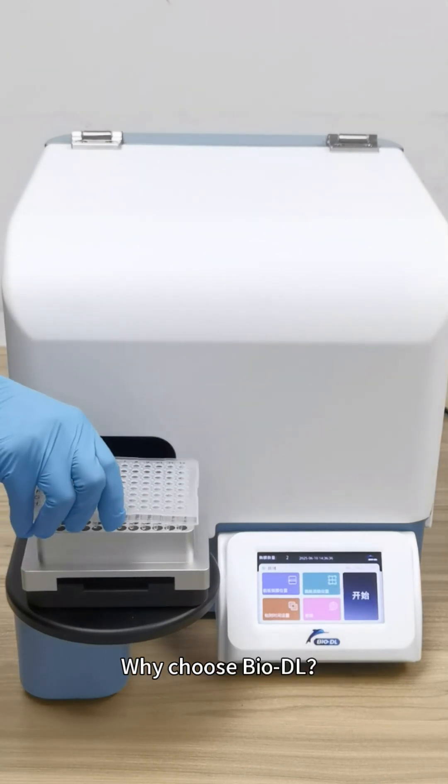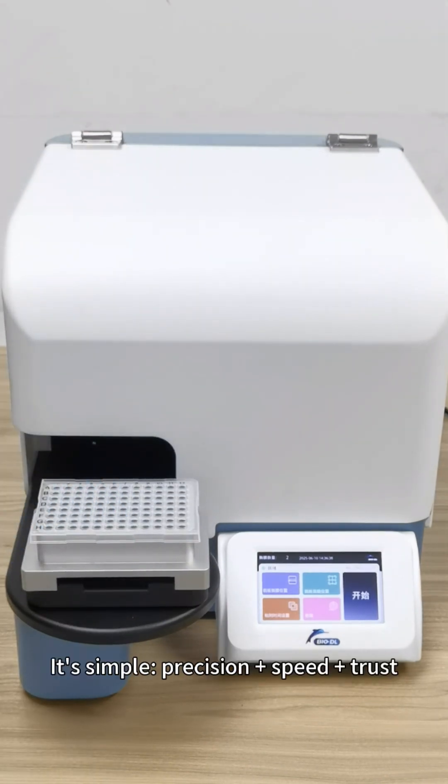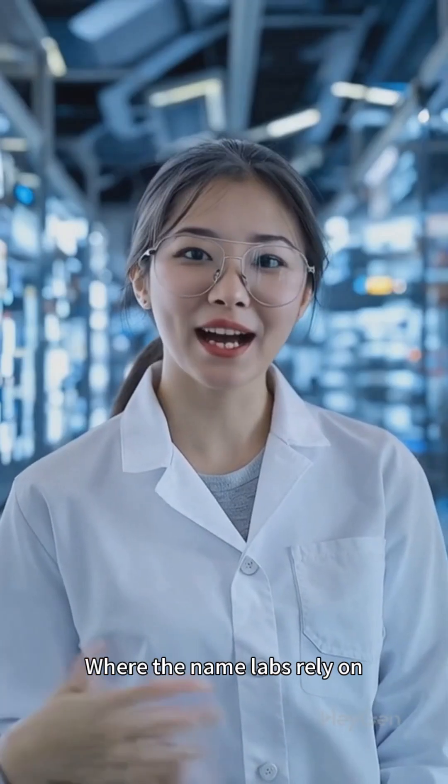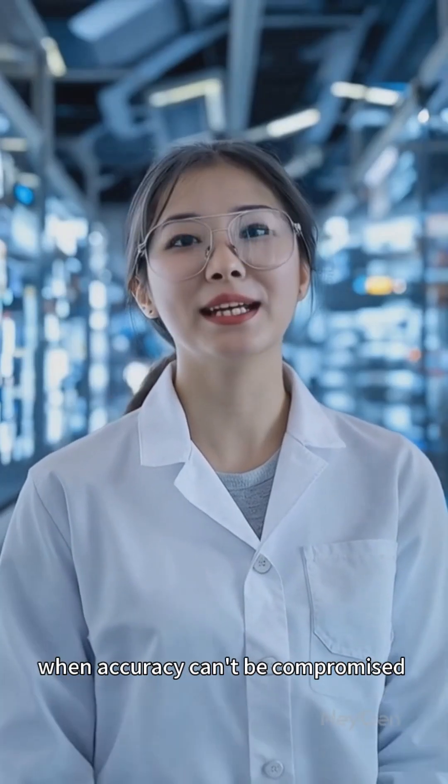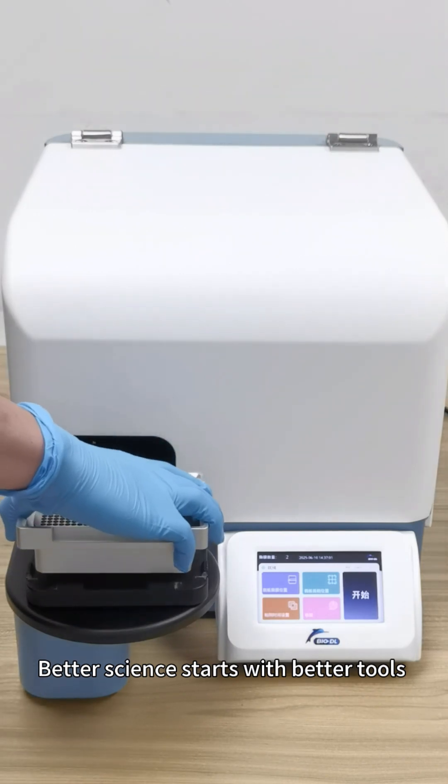Why choose BioDL? It's simple. Precision plus speed plus trust. We're the name labs rely on when accuracy can't be compromised. Better science starts with better tools.